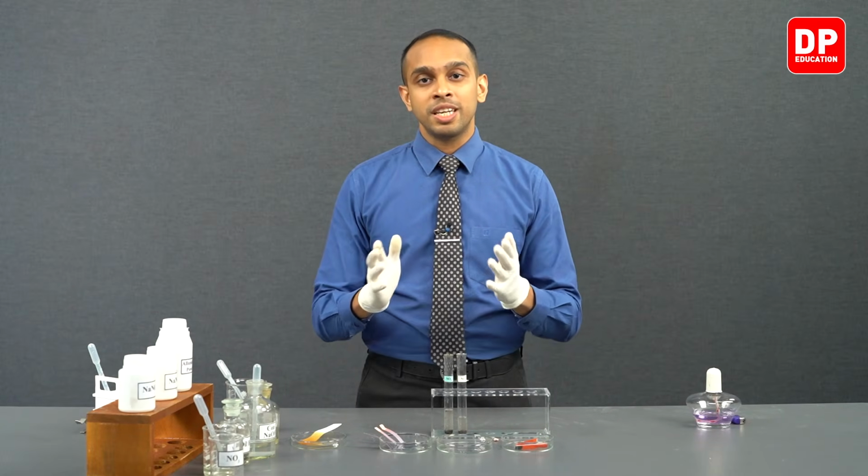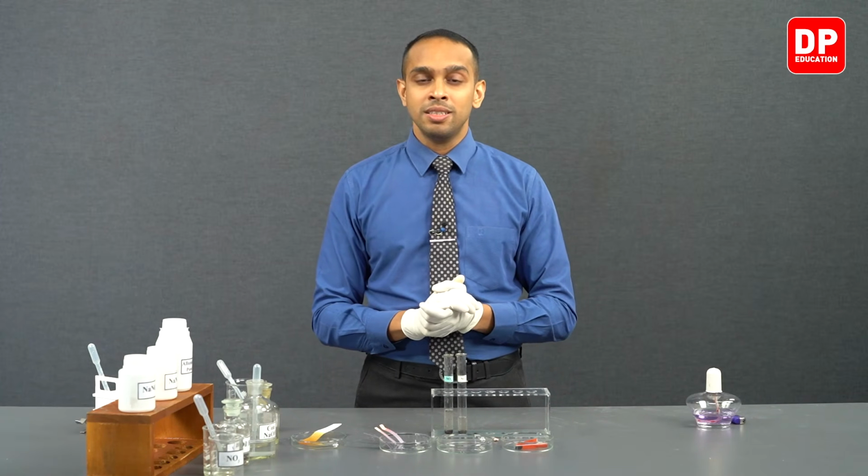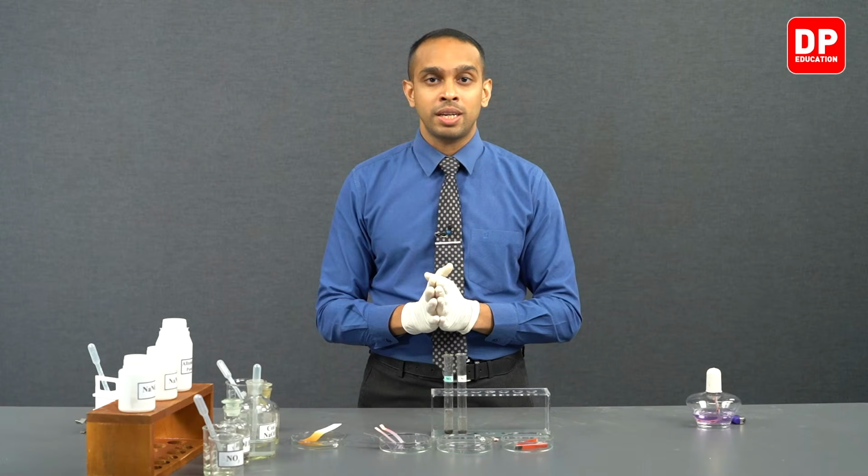At that point, zinc metal will get oxidized to form zincate ions, or if you use sodium hydroxide as the base, zinc will get converted into sodium zincate, producing ammonia gas from nitrate or nitrite ions.